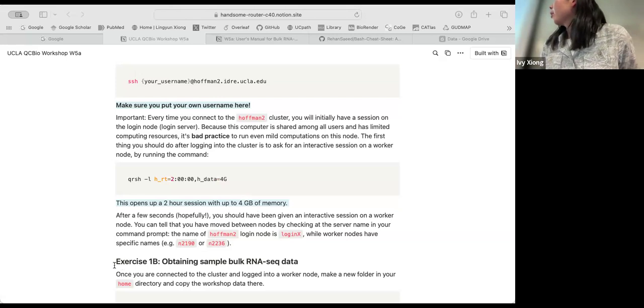And then we can check where we are. So it says login. So I think there are around 4 nodes in login. So we can list the content. I have a couple of folders in the home directory. So we can try to request the interactive node.